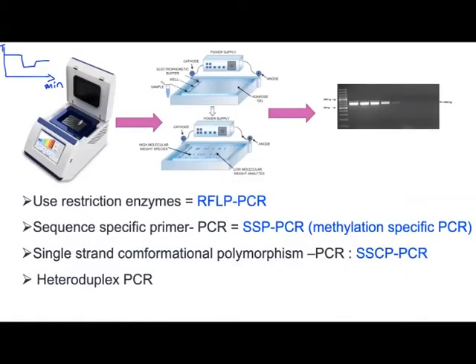And for this you need a machine that we call the thermocycler. From the name, it cycles the temperature. So with this machine, you put your sample tubes in the plates, you place them here, and you operate the machine. But at the end of the day, you need to take the tubes out, and if you want to collect the data, you need to run another experiment.